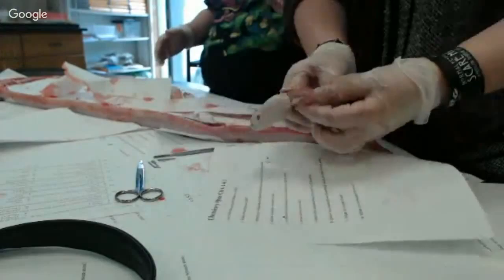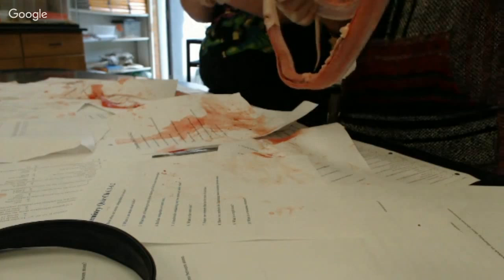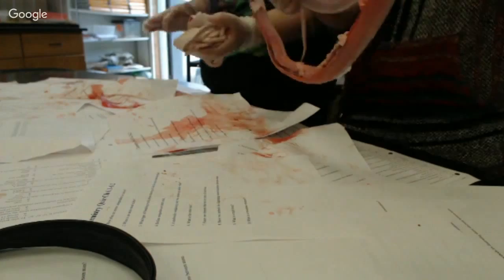Okay, so I need the body of the snake in a box. Come on, big boy. Let go. Yes, we still love you, even though we did this to you. Where do I put him? All the utensils need to be rinsed off. Mr. Taylor, which box? Utensils need to be rinsed off, and all the paper needs to be thrown in the garbage. Don't, hold on. I just set it down for a second.